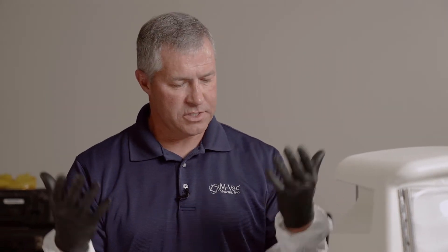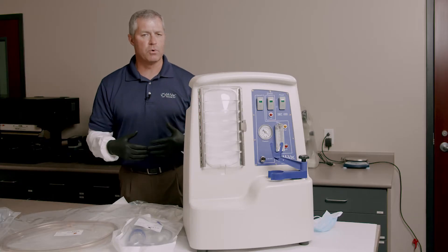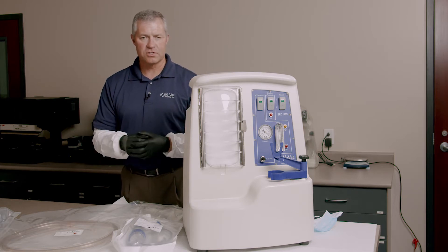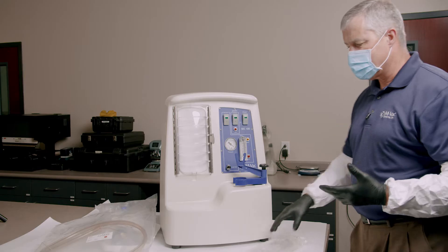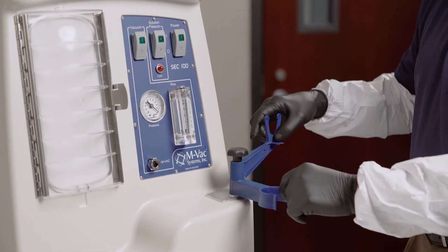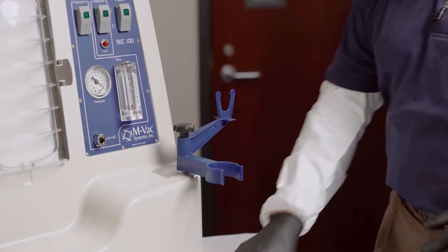The first thing I need to do is make sure I have my PPE on. Depending on the circumstances I might even be wearing a lab coat, but at a very minimum we're going to want to be gloved, have the arm protectors on, and have a mask. There's no set way that the MVAC has to be set up, but pretty much what I do is grab my supplies and get it ready to receive them.